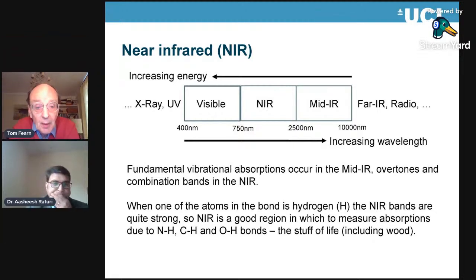So this picture here is labeled in nanometers, which is meters times 10 to the minus 9, which is what the units that are typically used for near infrared, although not exclusively, and that they're wavelengths. And the bit what we can see, the visible light, is between approximately 400 and 750 nanometers.